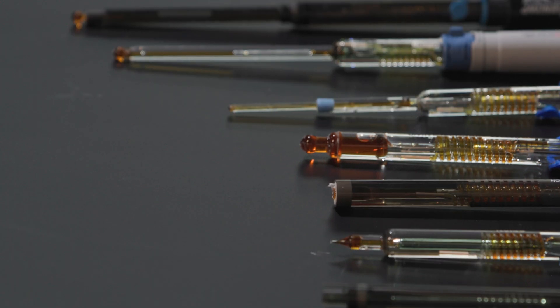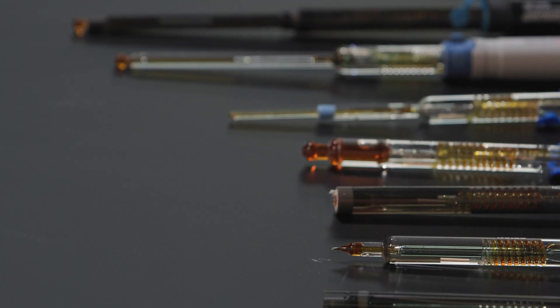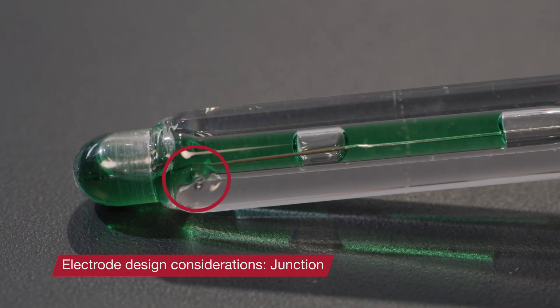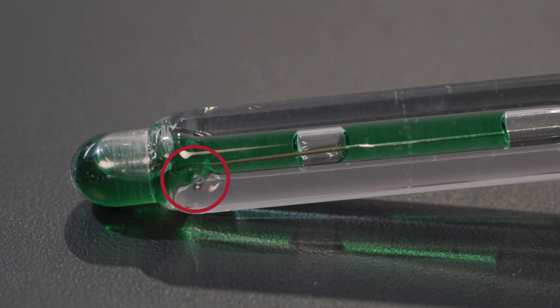Now it's time to investigate design. Not all electrodes are built the same. Differences in design are often a result of the electrode's expected use in a specific sample or application. One commonality is that all pH electrodes have a reference system. The part that makes contact with the sample is called the reference junction, and it can differ depending on the electrode design.